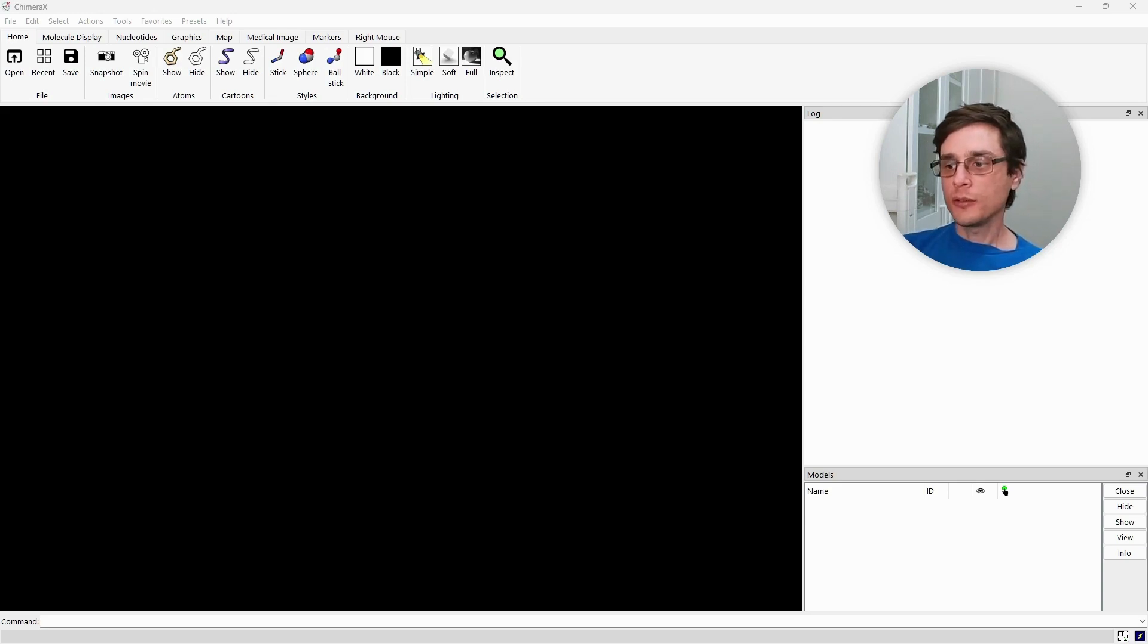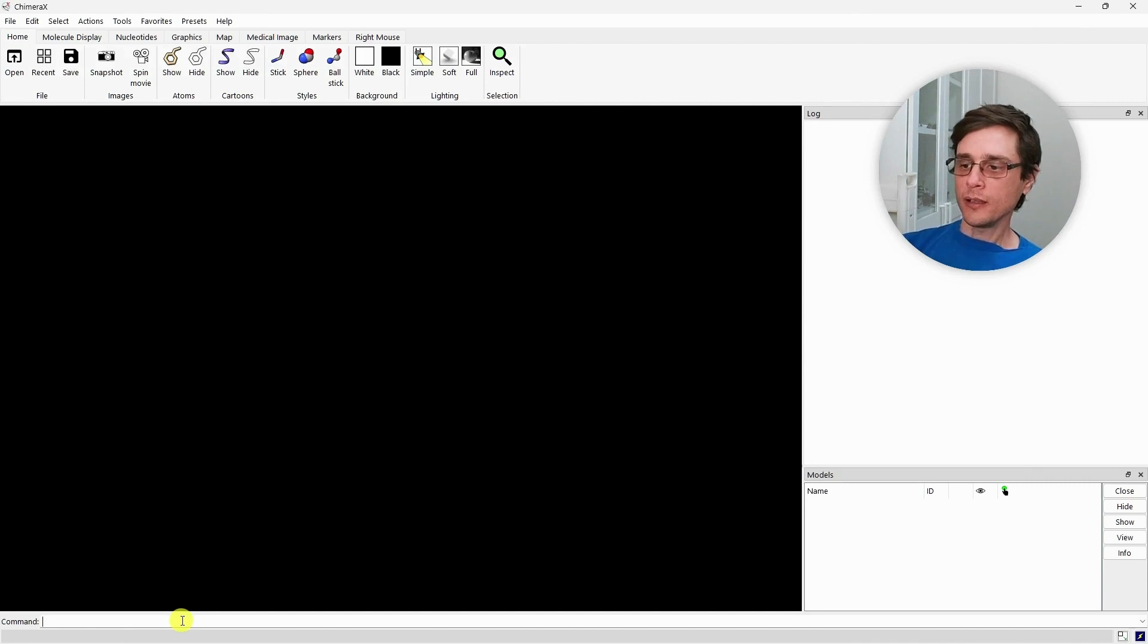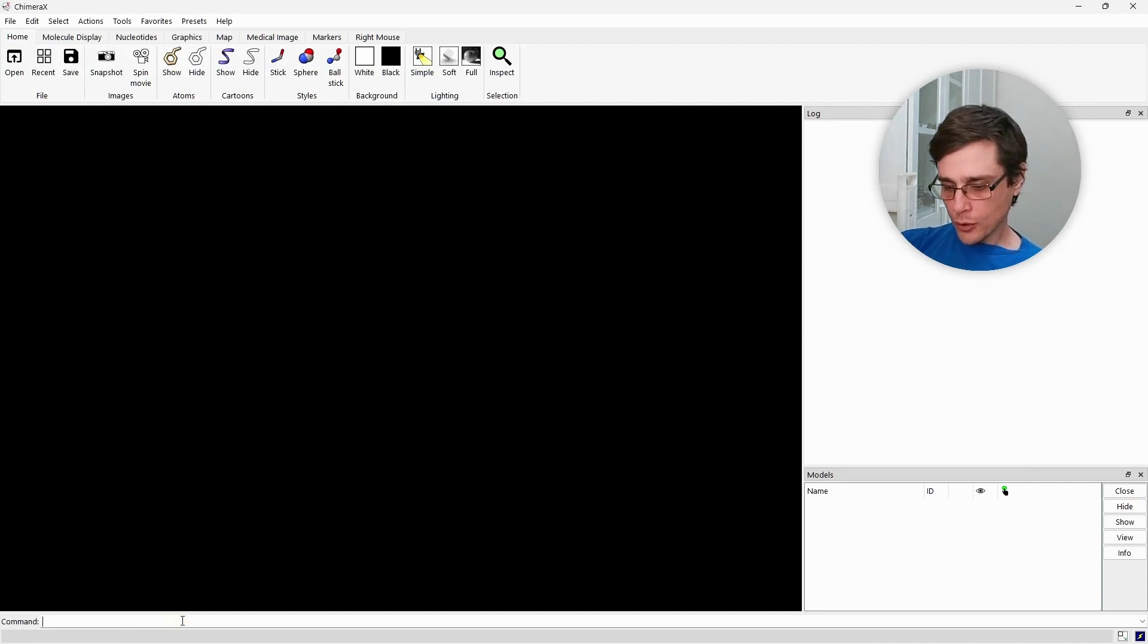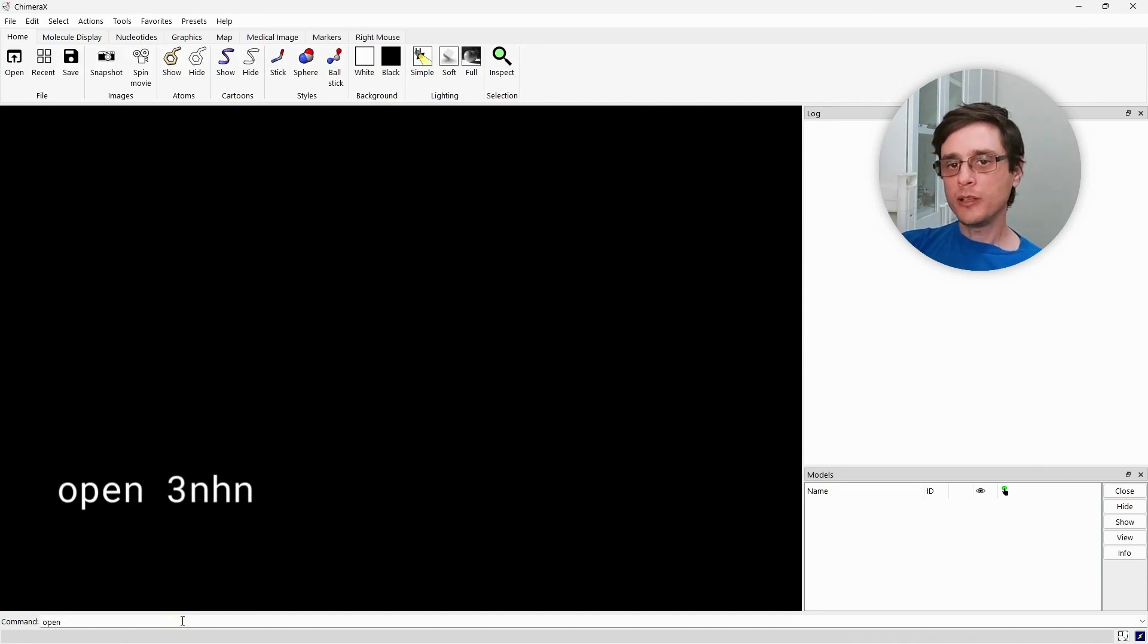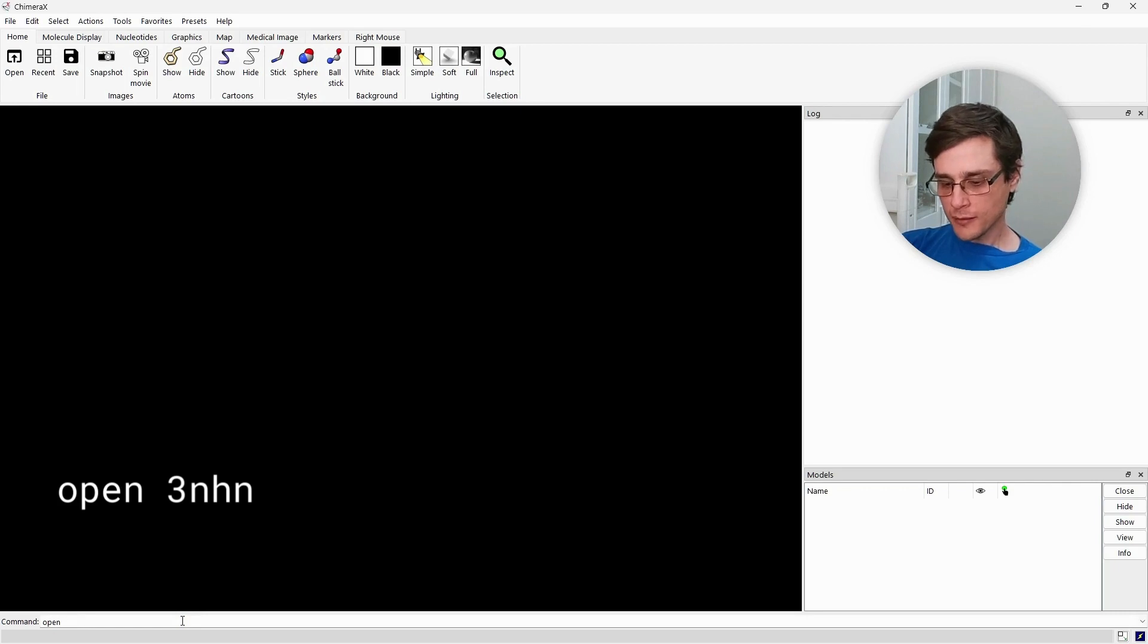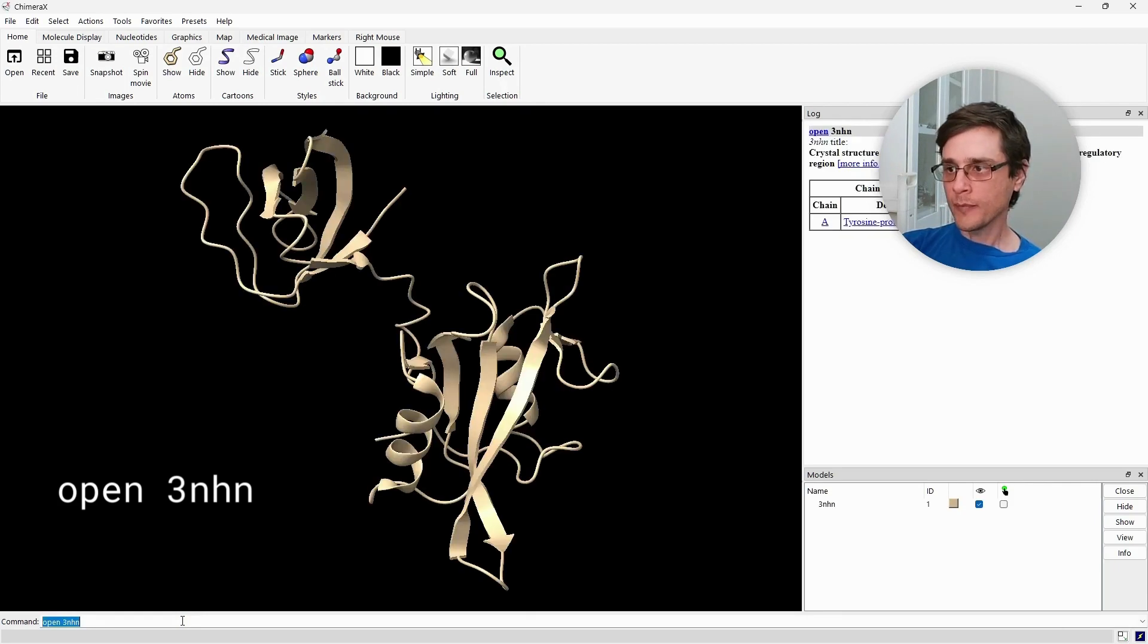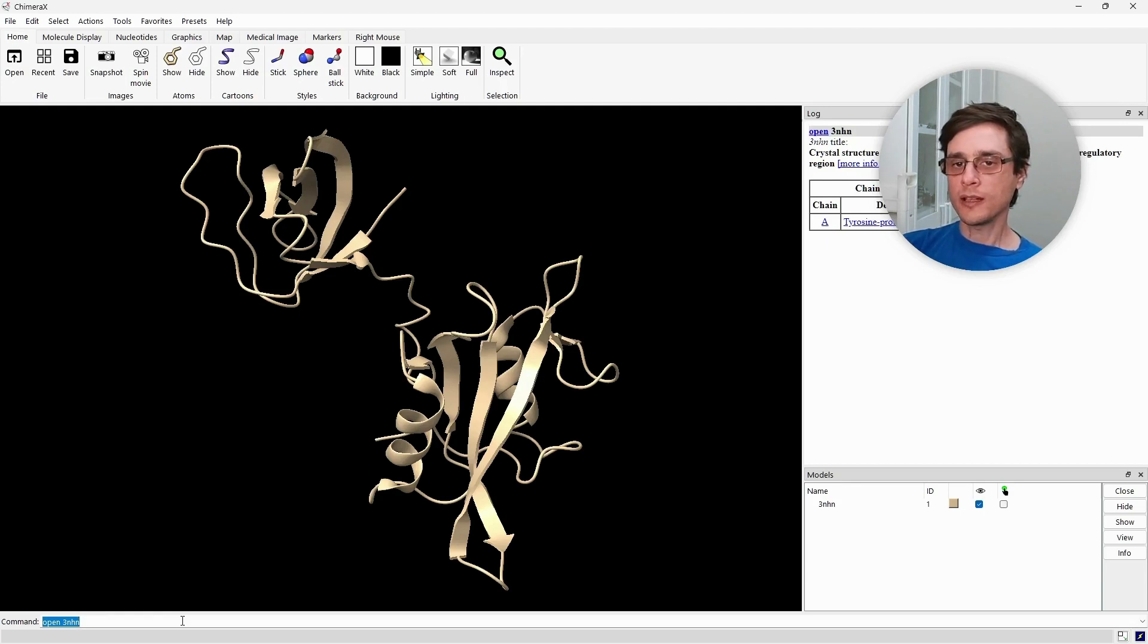We are going to load the PDB structure using the open command. In the command prompt, we type open and the PDB identifier, in this case 3NHN. And we can see that the protein was loaded with the default style of cartoon.